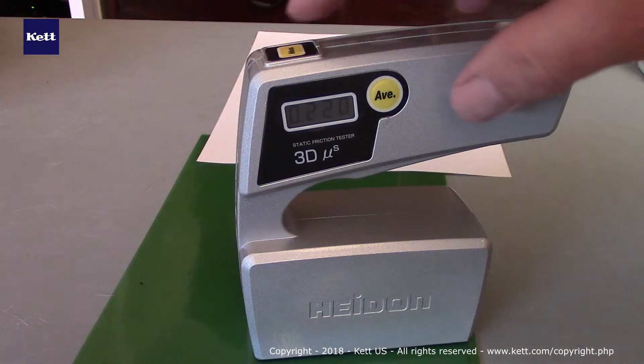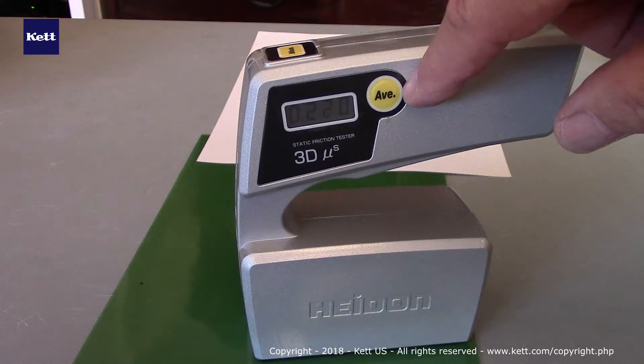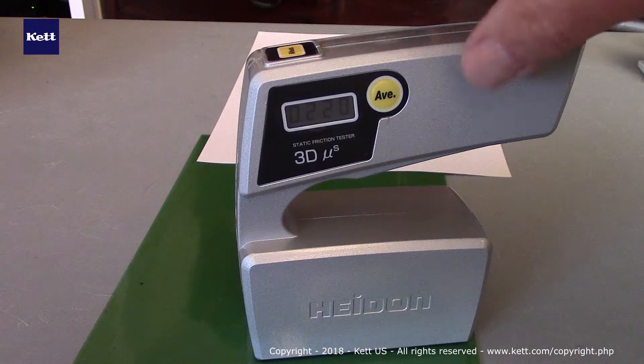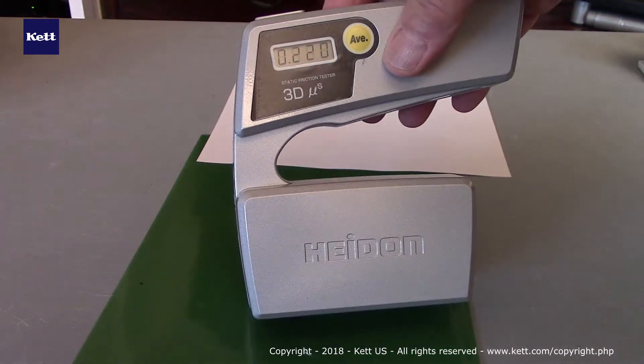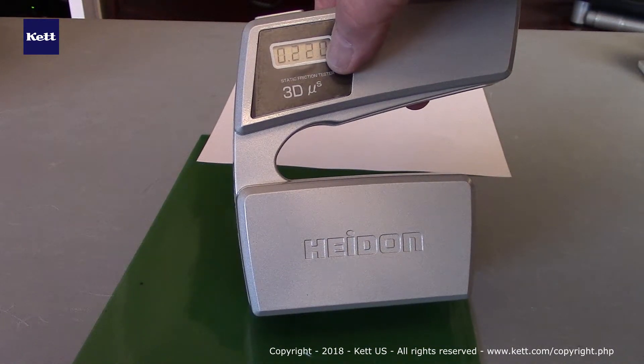To operate the instrument, we're simply going to press the measure button. You'll also notice that there's an averaging key. Since friction may vary across the surface, you might want to set up a protocol where you had multiple measurements. This allows you to average without doing any calculations yourself. Again, simple to use. When you get finished, you'll see a value here on the screen like so.